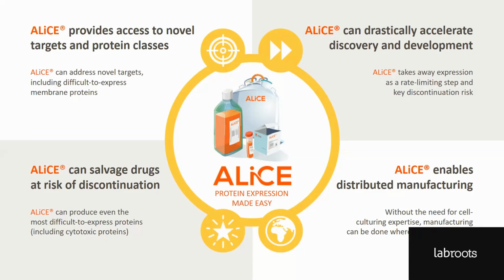As a cell-free system, using a small footprint of liter-scale reactions, or 10 liter scale reactions at our top end, we can also enable distributed manufacturing. This is a relatively new production paradigm. For example, can you produce a vaccine at the site of an epidemic, as opposed to at one site where it's then shipped out? These are new paradigms that are enabled by cell-free expression.